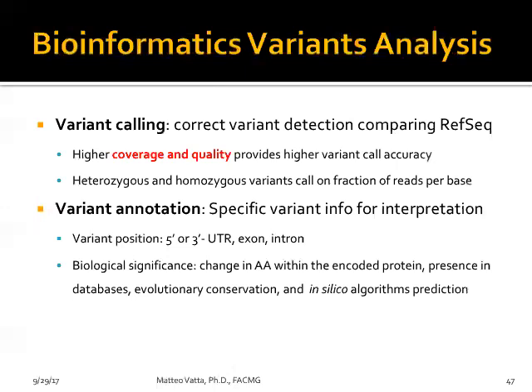When you are in a clinical laboratory, you also have to determine what is the minimum to call heterozygous versus calling homozygous. And the difference between single nucleotide variants and smaller or larger indels matters, because when you have lower quality, then also your ratio to call heterozygous or homozygous has to be adjusted accordingly.